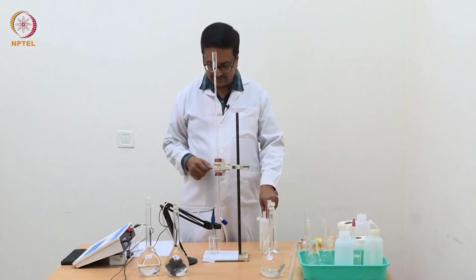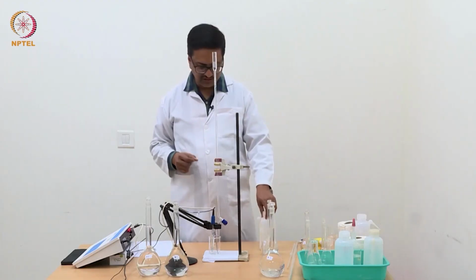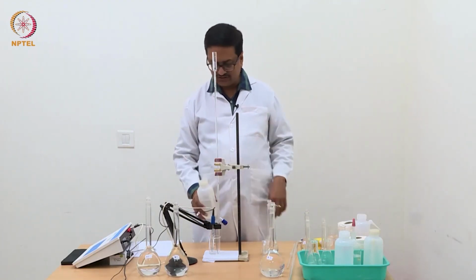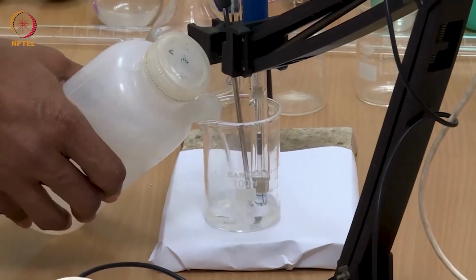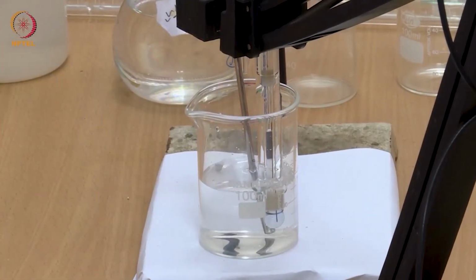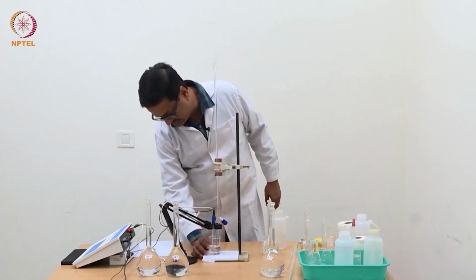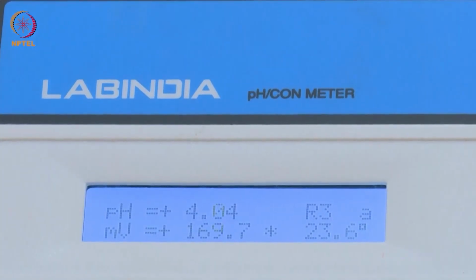Now you can see that after transferring this 10 ml of acetic acid in this beaker, the electrode is not dipped inside the solution. So we should add sufficient amount of water to make sure that the electrode is immersed and the pH meter reads the correct pH of this solution.